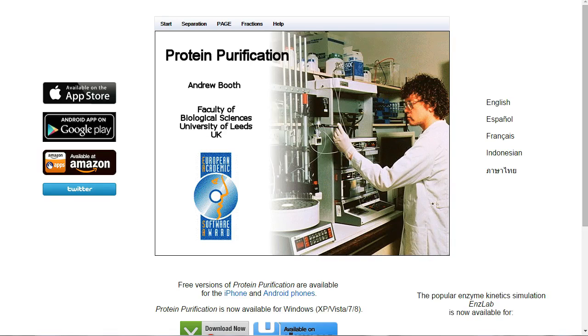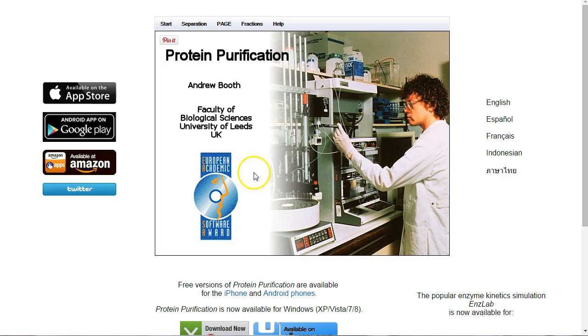In this screencast, we're going to go through a simple demonstration of the protein purification software. We'll look at how it can be used, and we'll have a go at purifying a simple protein.